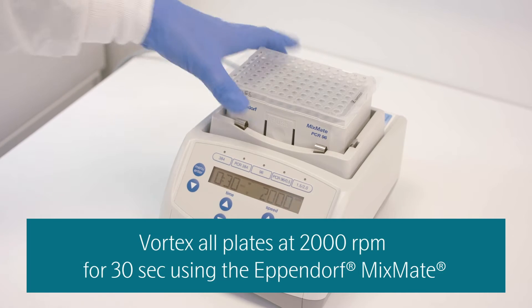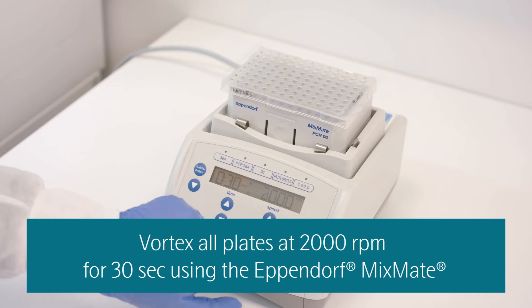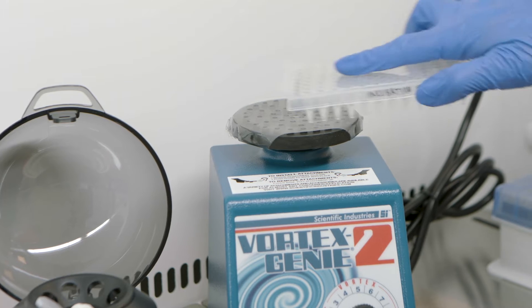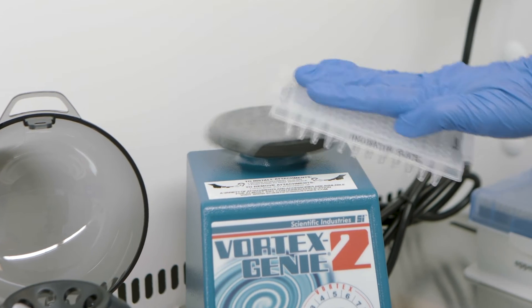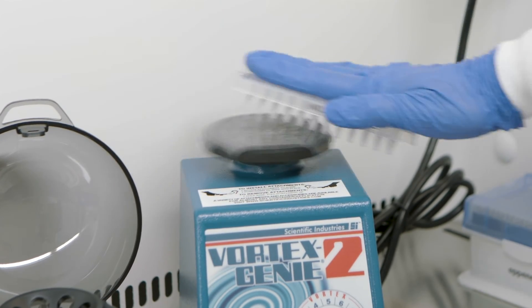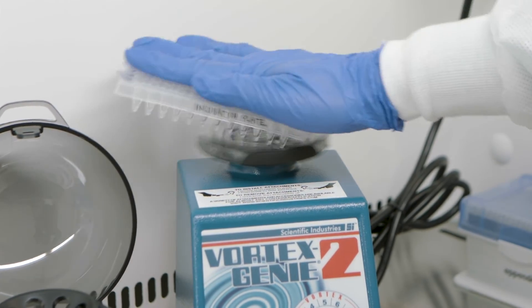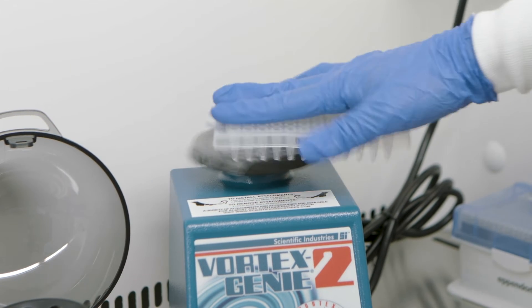Plate vortexing should be performed using the Eppendorf MixMate and the appropriate tube holder. This is required for the pre-PCR plate vortexing, but optional post-PCR. If manual plate vortexing is used post-PCR, it must be done using the technique shown here. Please watch the Olink vortexing technique video before continuing.